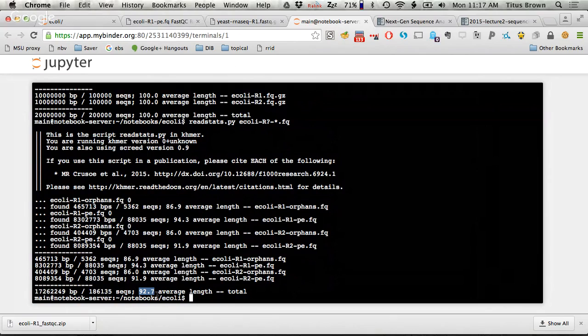With the lenient trimming, we got rid of 1% of the sequences. Here, we're getting rid of 10% or more. If you spent a lot of money on your sequencing and have a lot of data, it's okay to get rid of 10%. But if you're pushing the edges of your sensitivity as it is, then getting rid of this extra data may be problematic.